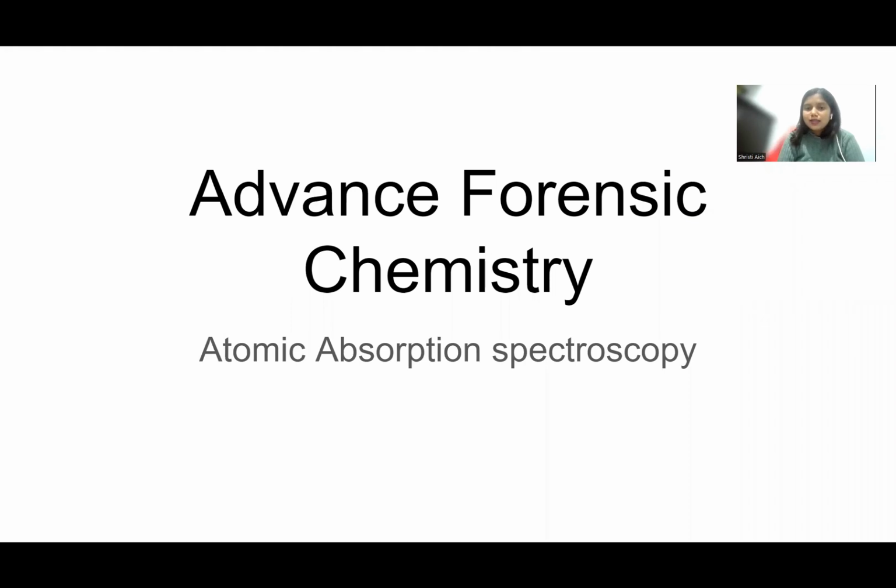So why are we studying this? This is one of your topics, an indirect topic in the advanced forensic chemistry syllabus. When we have to check the concentration of a particular element, whether it might be present as an adulterant or in certain drugs, during quality checks, when we have to determine the concentration of a particular metallic element, or what kind of metals are present, that time we can use it.